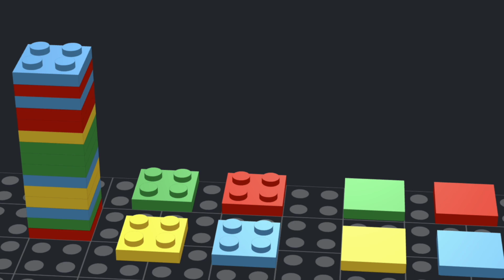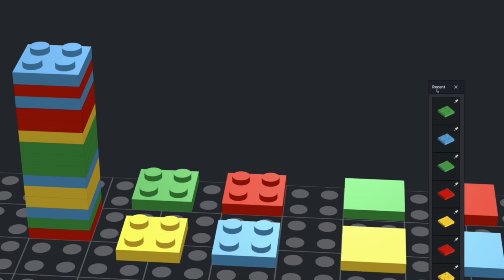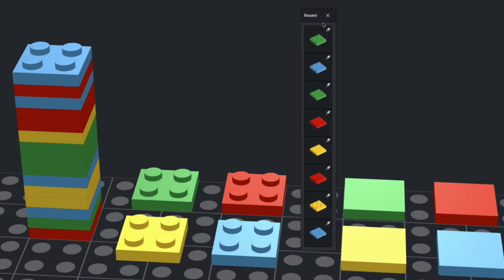Whereas the ddNTPs don't contain that hydroxyl group at the 3' end of the molecule, and so therefore no further DNA can be extended off that end, therefore basically ceasing the extension or the continuation of the DNA sequence. Now in our sequencing reaction, we essentially have dNTPs and ddNTPs, which are made up of these kind of blocks here that you can see.